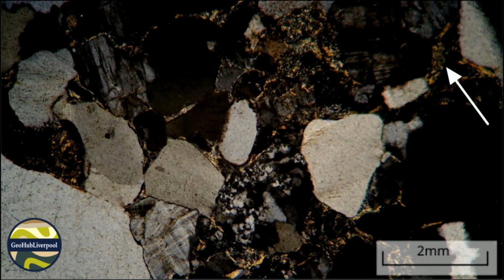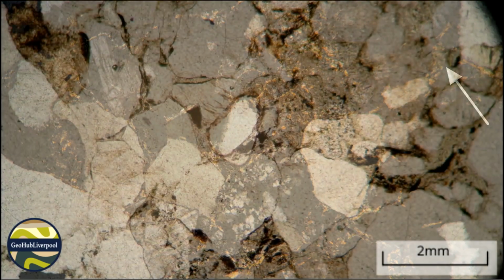The material between the grains, the intergranular material, is fine-grained. Although it was turbid or cloudy in plain polarised light, it has low-order interference colours under cross polars. This material is composed of clay minerals.